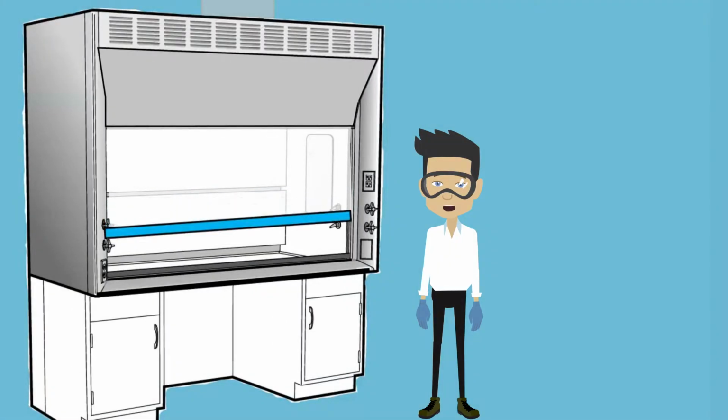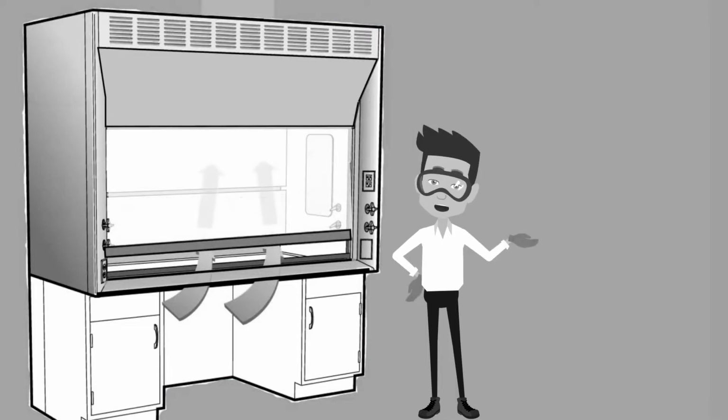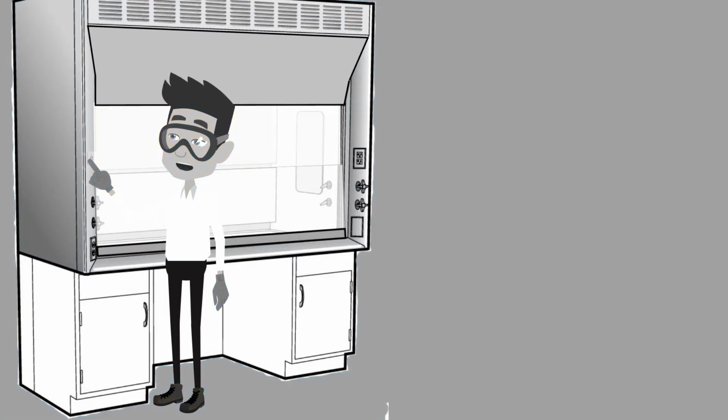In case of a power outage, the hood sash should be lowered within an inch to maintain a chimney effect to keep some air flowing into the hood. Keep the sash closed when the hood is not in use and turn off its light to conserve energy.